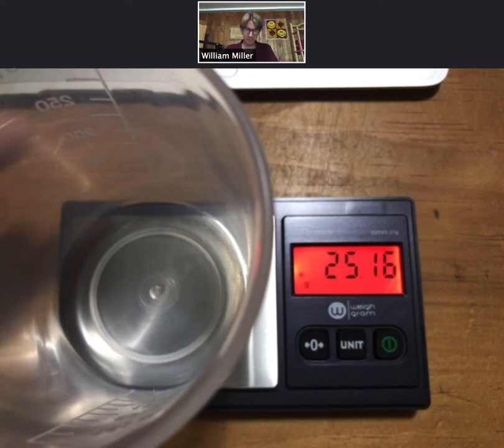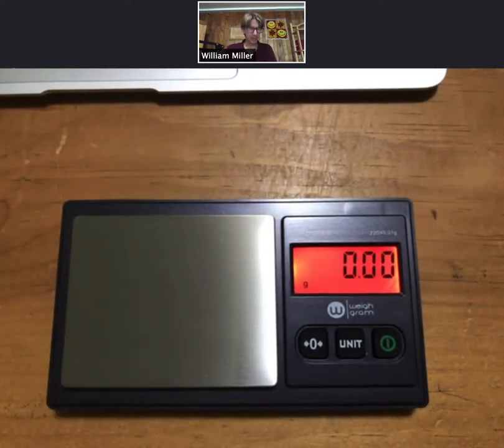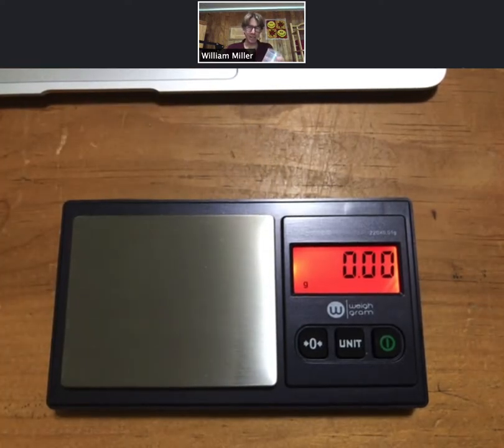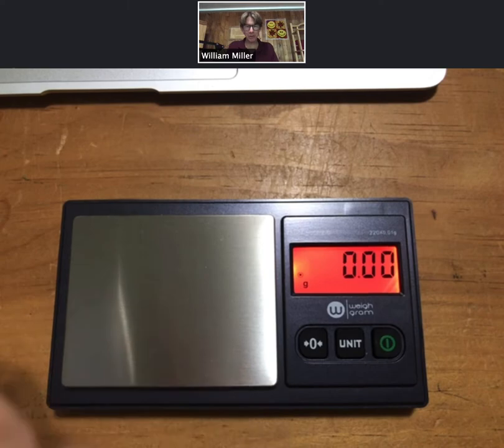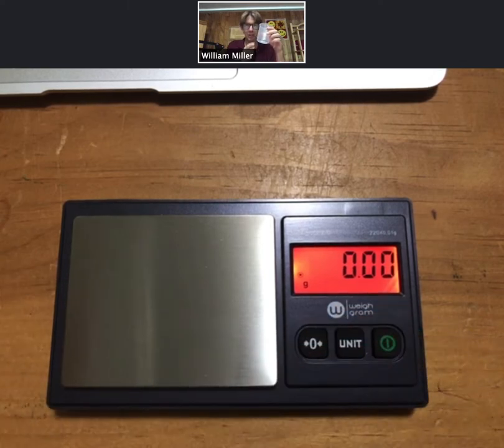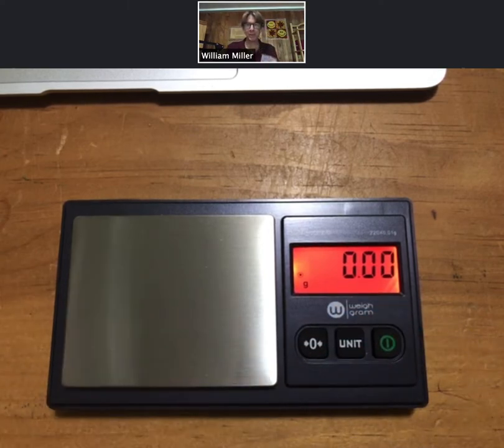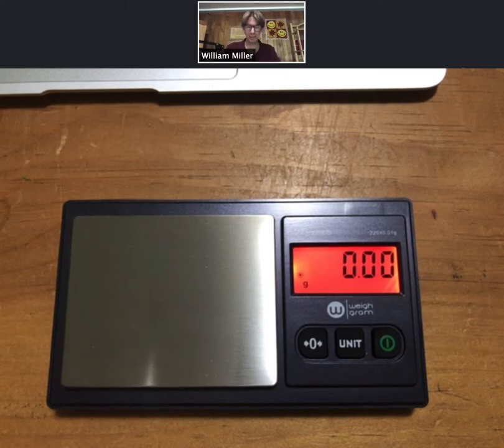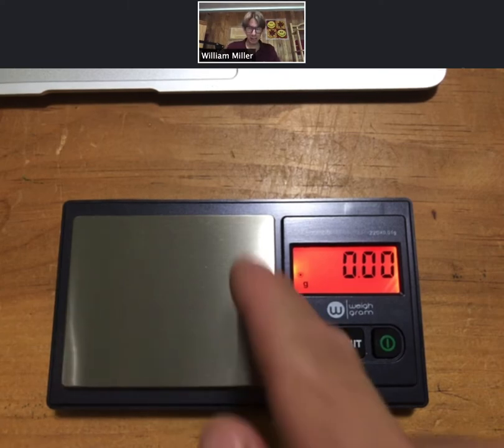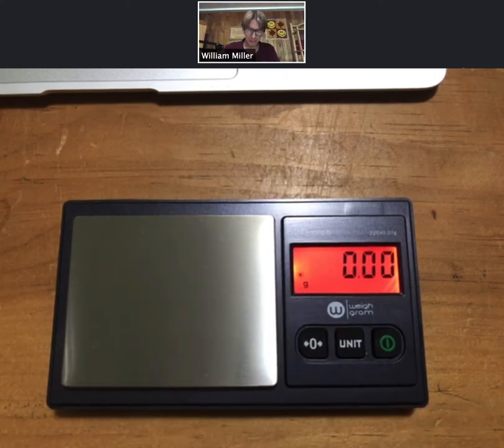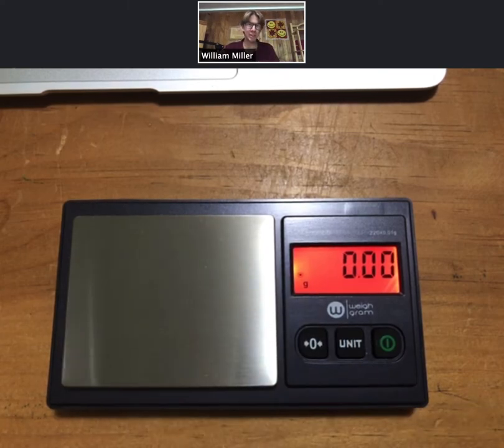Another important thing about this is make sure that your beaker and your scale are both clean and dry on the outside. You can see this is clean and dry, just make sure.